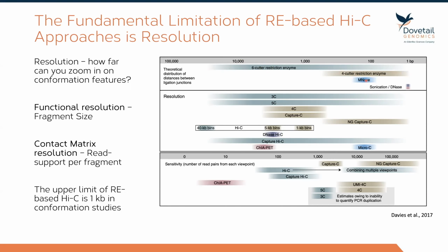When you use MNase to chop up the chromatin, you get nucleosomes, right? And that is a very nice titer around that nucleosome, so you get fragments that are around 146 bases. Now, when we move into resolution, which is how you have to bin your genome to be able to look at it in a contact matrix, I'll show you a bit more about that binning here soon.